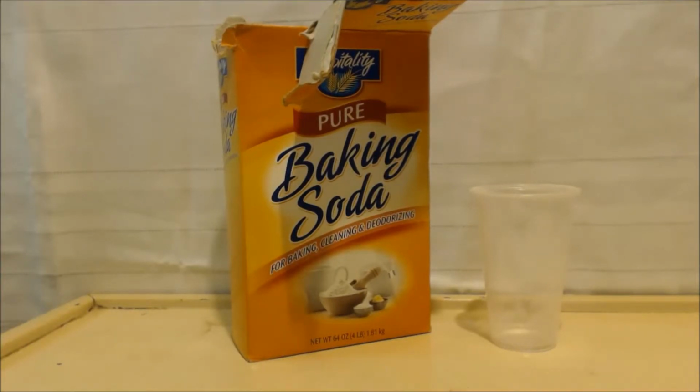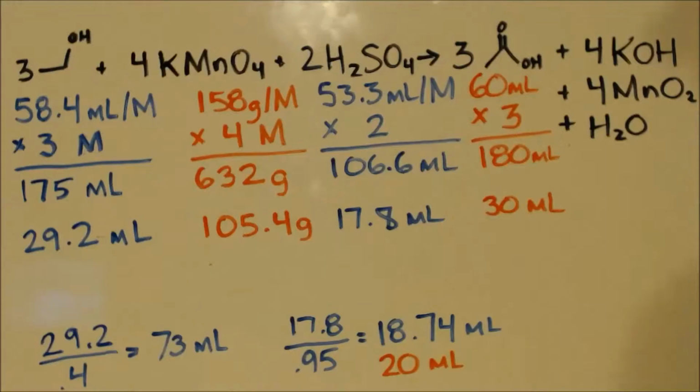I mean, wow. I thought that'd be impossible. This is a good result. It gives me more confidence on the aqueous one. Like I said, if you just put the pot on some ice, give it an ice bath, and make the condenser longer, you get a lot better yield. But I am so amazed at this.